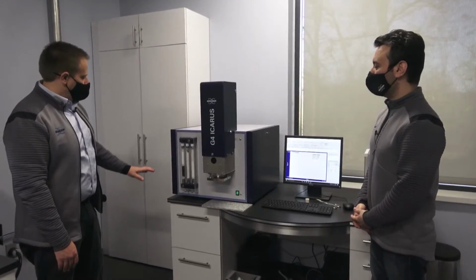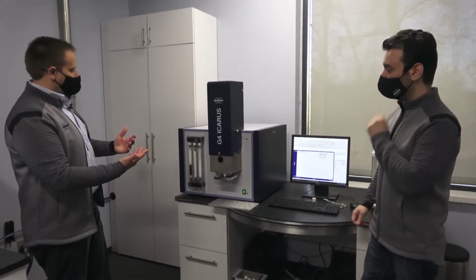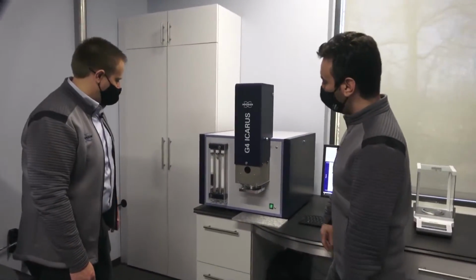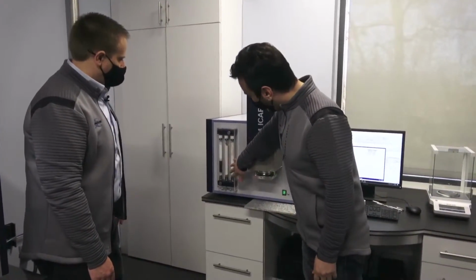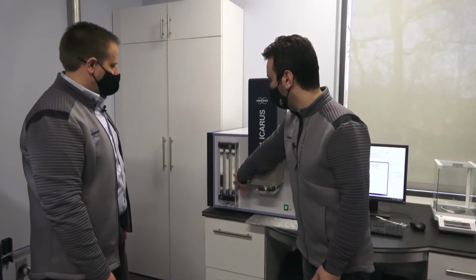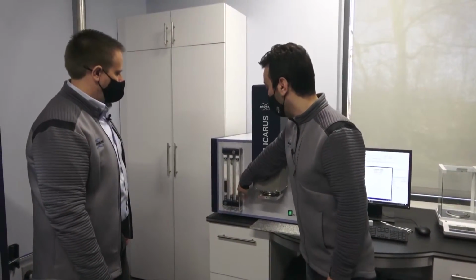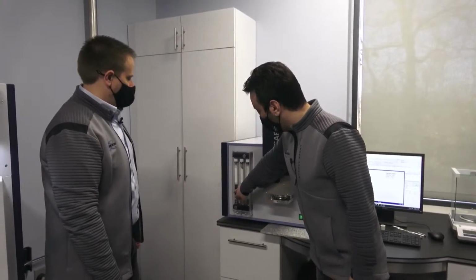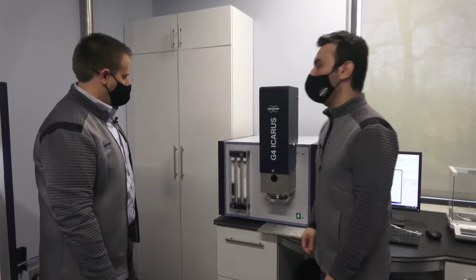Yeah. And it looks like the first thing that pops out to me are these tubes. What are those? What's that going on? We have some chemicals on the front side. Yep. This white one that you see is magnesium perchlorate. This is for removal of moisture that you may have in the sample, especially if you're analyzing more samples. And this one is sodium hydroxide to eliminate the CO2.